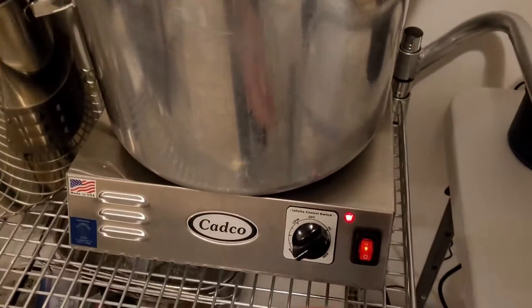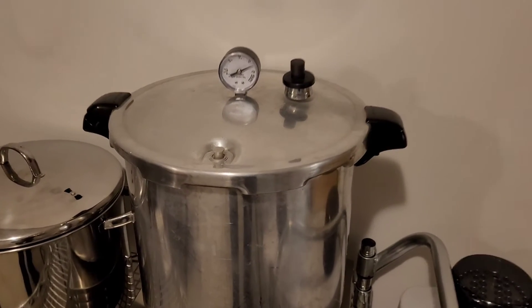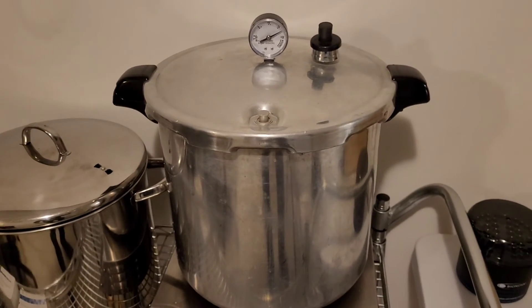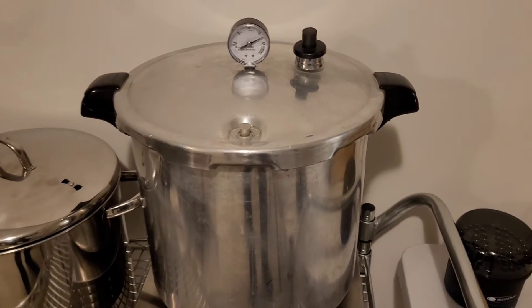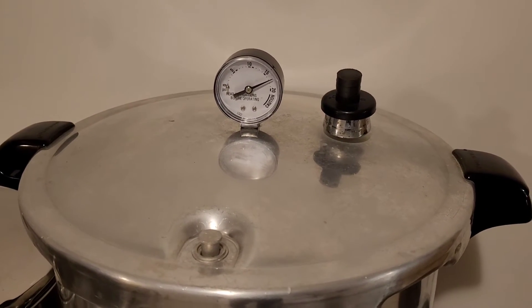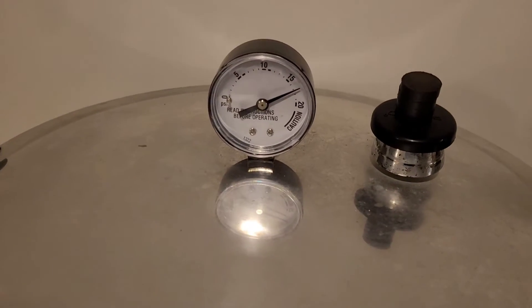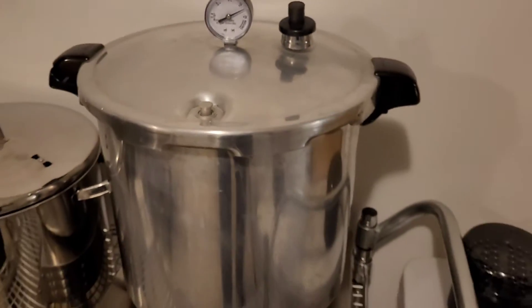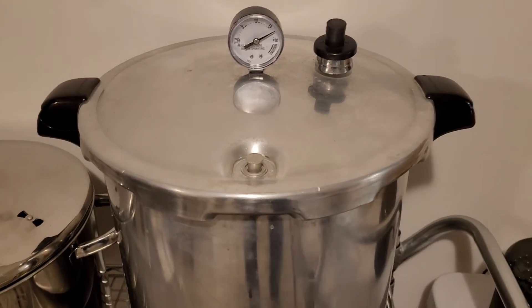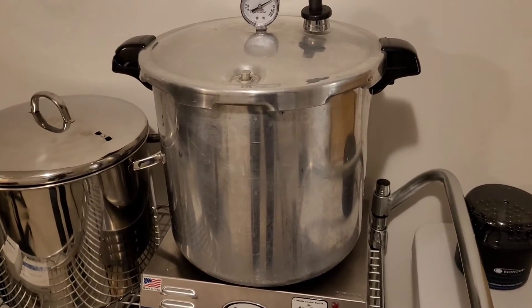Alright, timer is up. Turn off the heat and allow it to come down to room temperature. As the pressure cooker cools down, the bags will vacuum seal on their own. Do not try to hasten the cool down by taking off the jiggle weight or anything like that. Allow the dial to at least come to zero, but best to just leave it until it comes to room temperature, because these bags are going to be pretty hot and they're going to take a while to cool down. Best to allow them to cool down inside the pressure cooker where it is sterile.